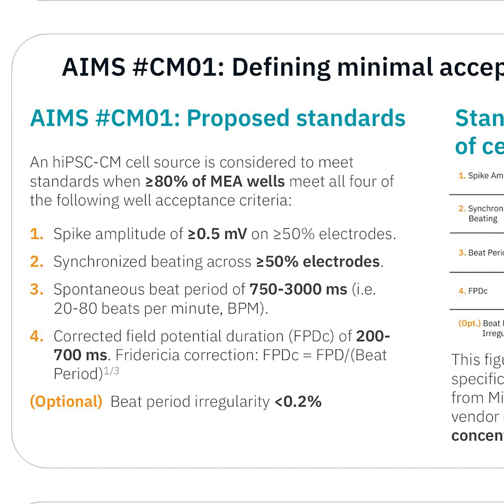See Miller et al. 2018, Figure 2. Although the corrected field potential duration of these 2 cell types differed significantly, consistent concentration-dependent effects were observed for both cell types. See Figure 5. An additional point to consider: spontaneous beat regularity.